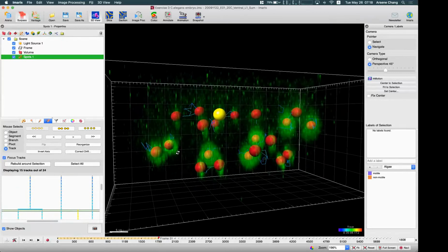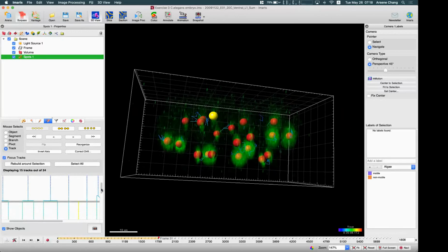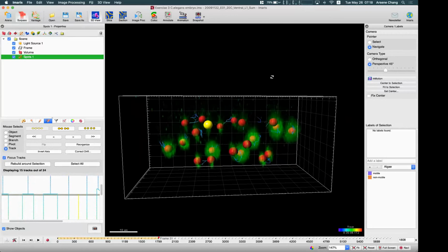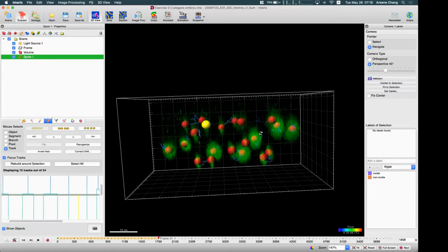So in this case, we need to correct it. The split can be done indirectly in the batch process if you make a deconvolution template with the decon algorithm. Hi, Arnold. Yep. So you mean, can it be combined with the deconvolution and this lineage track?